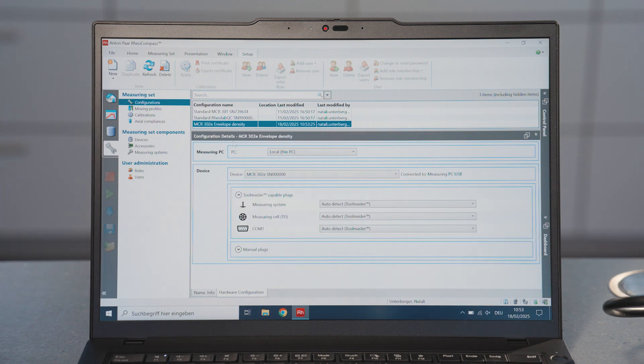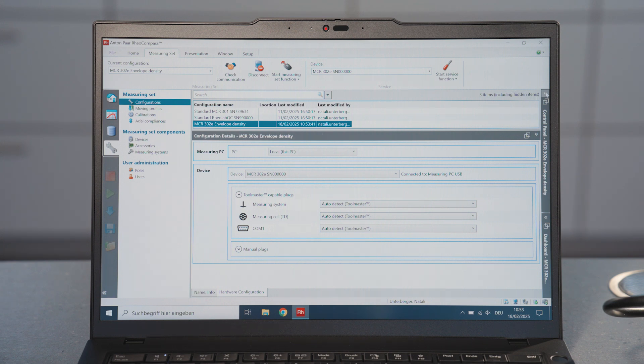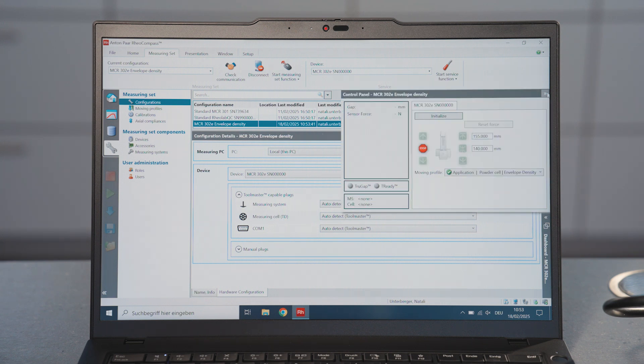To apply the new configuration, select Measuring Set, then Current Configuration. Perform Instrument Initialization.